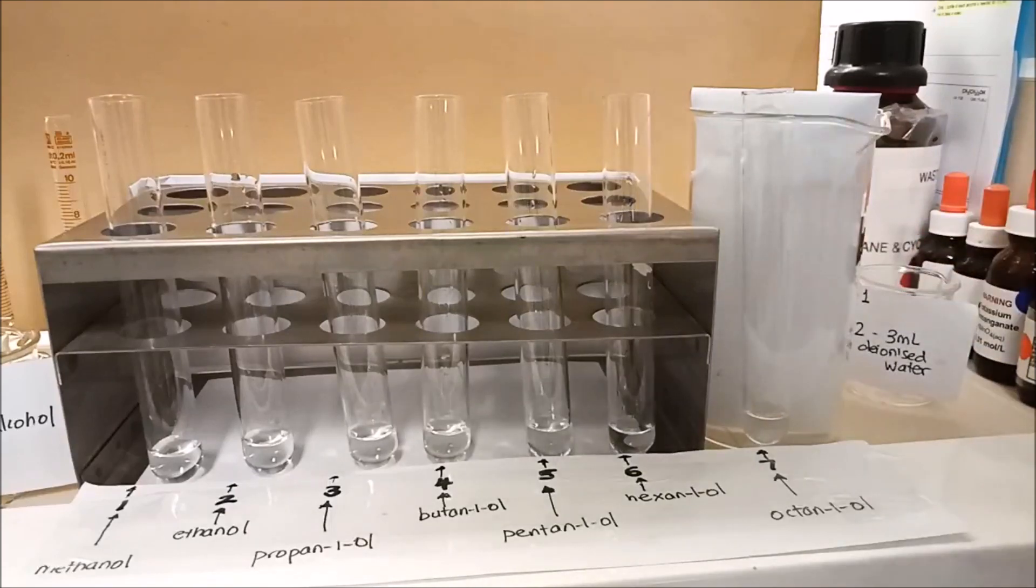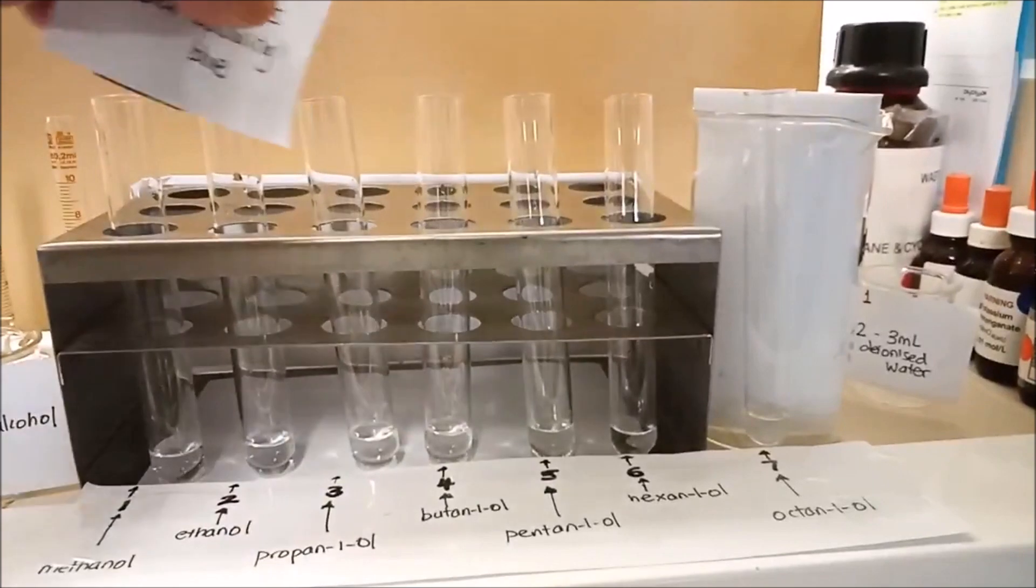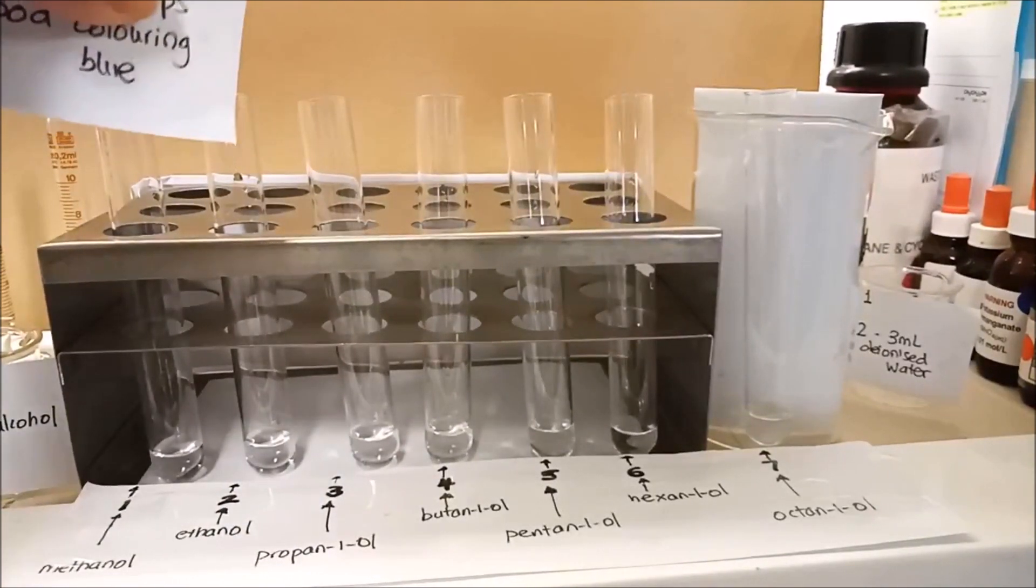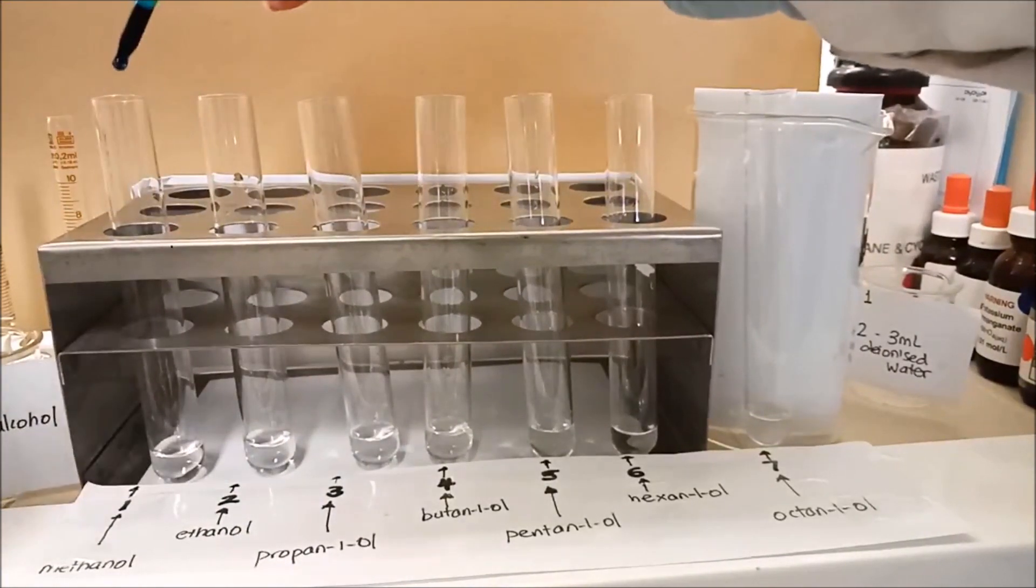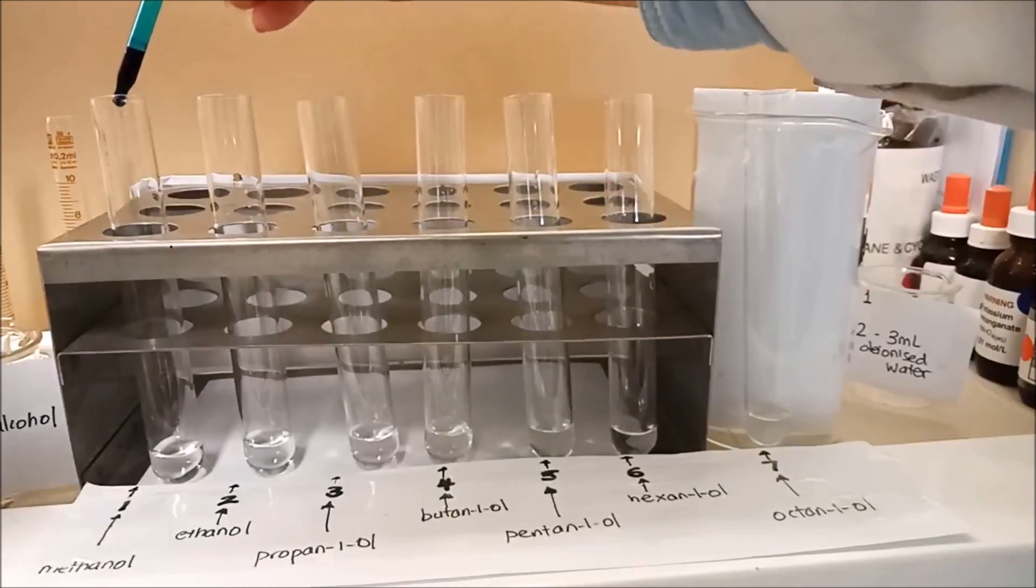Now we're going to do step two where we're going to put in food coloring. One drop of food coloring in each of the test tubes. So deionized water plus one drop of food coloring.